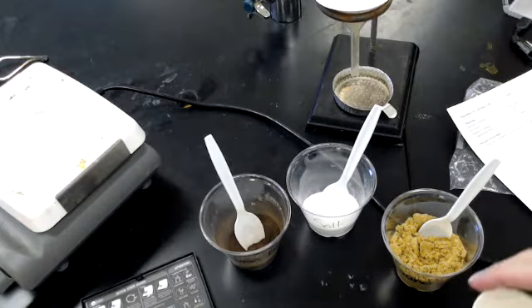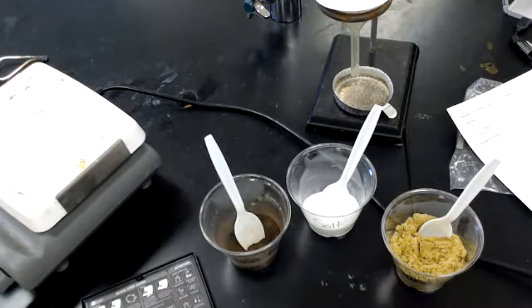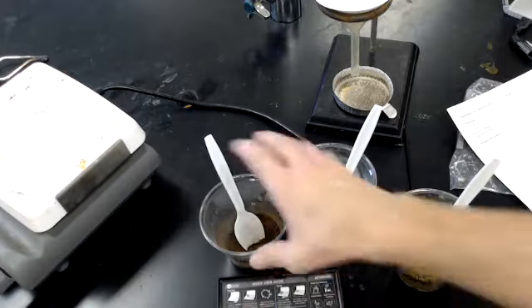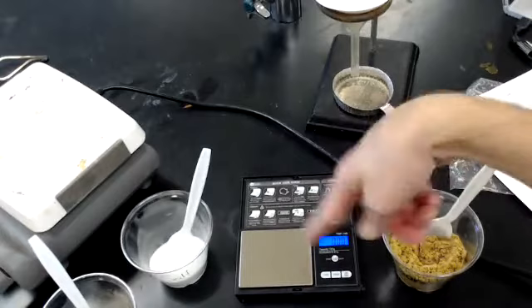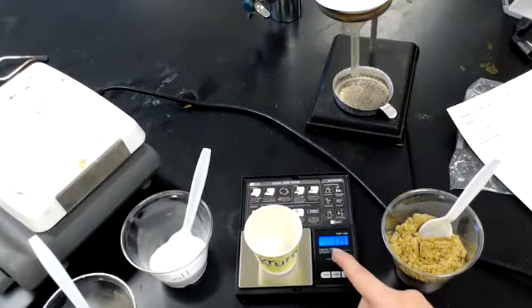I'm going to call this the mixture container, and I'm going to put it on my electronic balance here. I'm going to move these out of the way just a moment. There we go. My scale reads 0. I put the cup on and it reads 1.79.